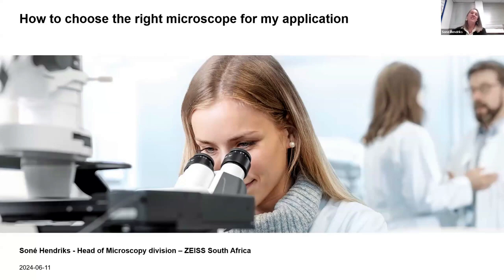Thanks, Soné. Thank you. Good afternoon, AB community. It's my privilege to talk to you today about different microscopy techniques and technologies that you can use to study biology. My aim is to use the next 20 minutes to give you the important considerations about your sample and your experiments that will enable you to choose the right microscope to ensure that you get the best possible results for your research.